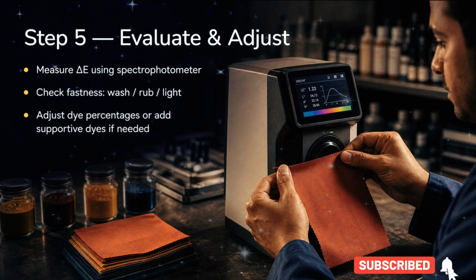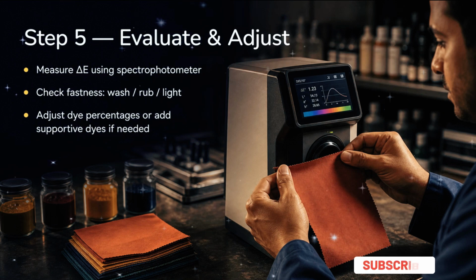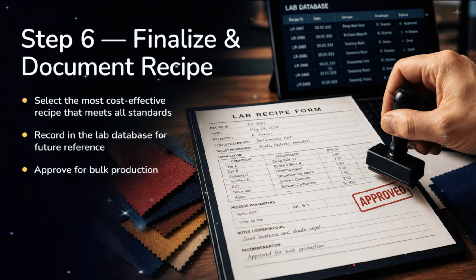Use a spectrophotometer to measure delta E and check fastness properties like wash, rub, and light resistance. Adjust dye percentages or add supportive dyes if needed to meet the target shade and standards. Step 6 is finalizing and documenting the recipe.